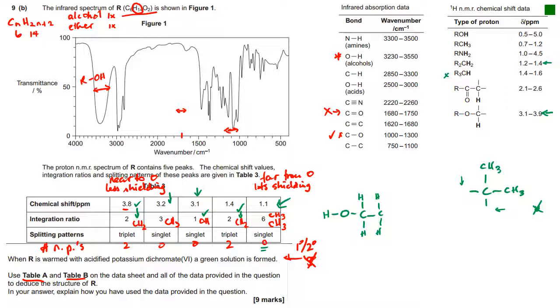And just checking out the table on the right hand side, it could be from this bit of data here as well. So if we're going to draw a CH3 group that's close to an oxygen, don't we just draw it like that? Now we know it's an ether link, so this has got to be connected to a carbon. But I'm just going to cross that out so far because it's likely to be one of the carbons that we've drawn already.